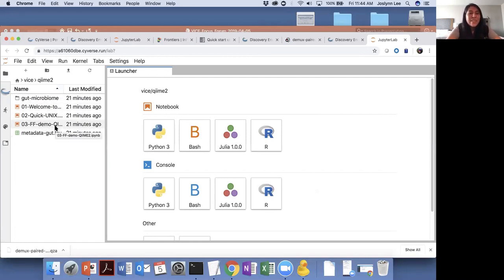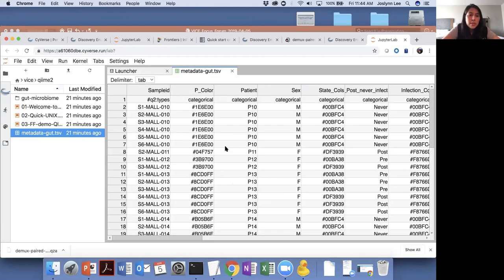Okay, so if you wanted to reproduce what I did and selected that QIIME2 file, you'll get the raw reads from the paper. You'll get access to the 3 Jupyter notebooks so you can get familiar. Whenever you're going through some of the downstream QIIME2 analysis, you'll need to have your metadata. The individuals who published this paper did a really great job. All I had to add in was this row of identifying the QIIME types of categorical or numerical.